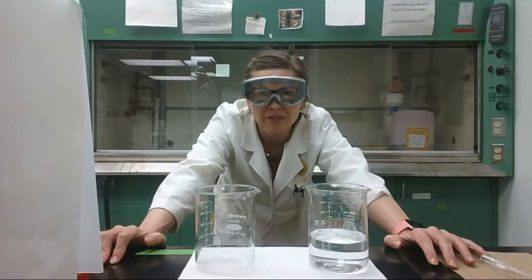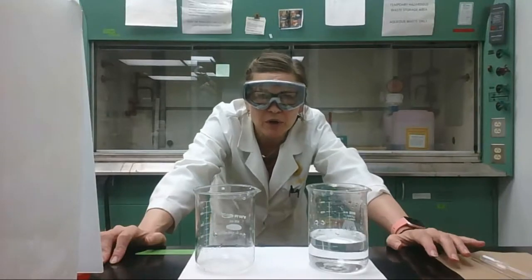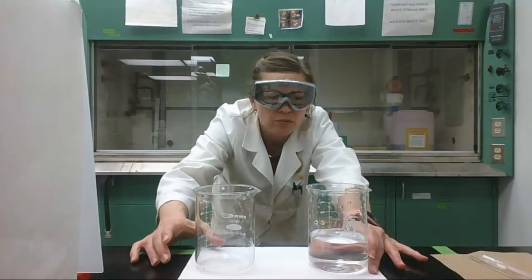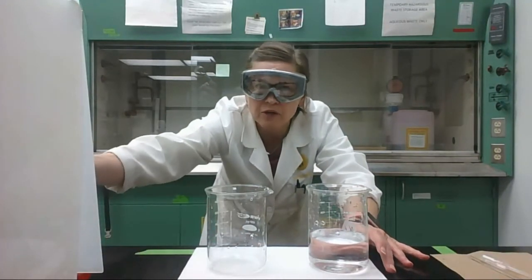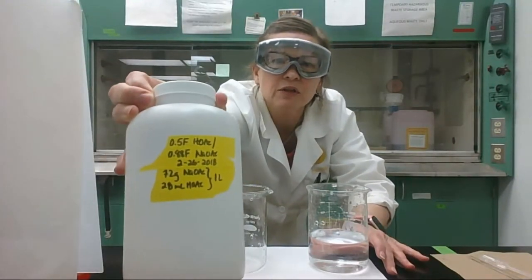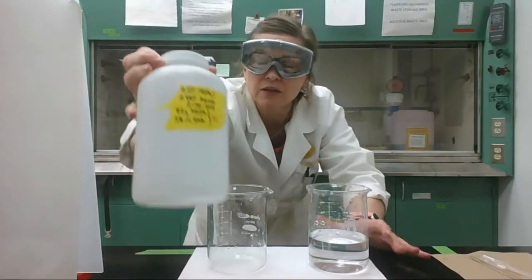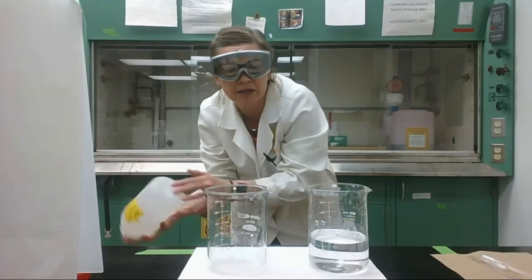Hi everyone. I thought that we could talk about buffers in the lab today, so I want to do a little demo for you. In this beaker, I've got some deionized water, roughly, I don't know, 250 mils or so, and in this other beaker, I'm going to pour some buffer. And I don't know if you can see the label here, but it's a buffer containing acetic acid and sodium acetate, or you might think of that as a buffer containing HA and A minus.